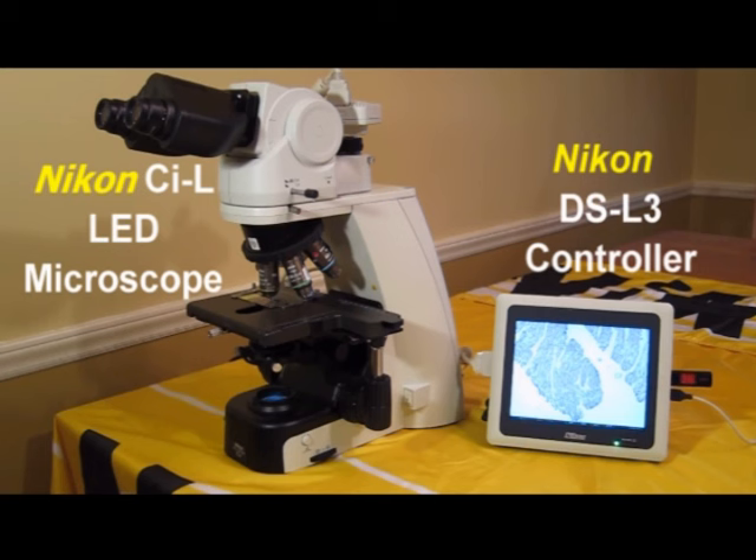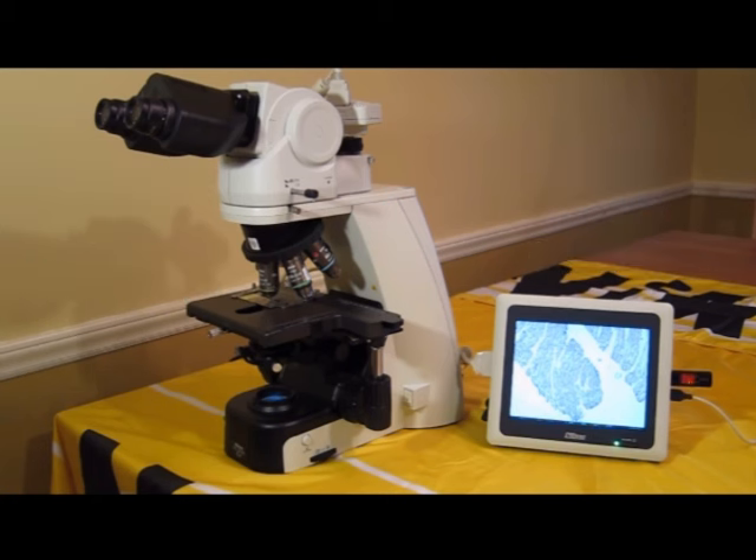The DS-L3 controller, pictured here, is a standalone system that does not require a computer. Of course, a computer can be connected by way of a USB or network cable. The best feature is that the Nikon DS-L3 controller is easy to use.